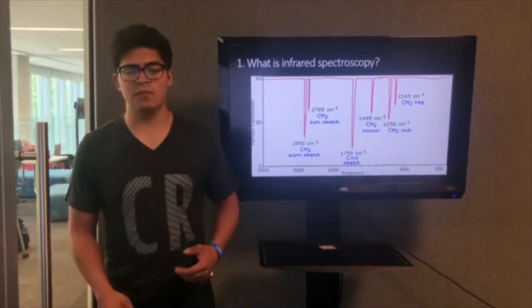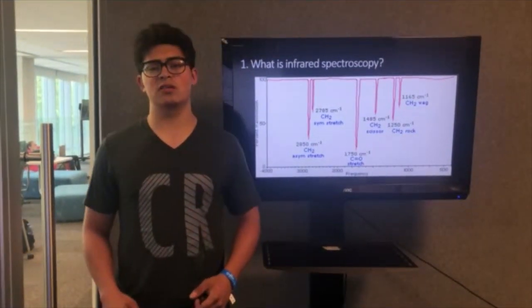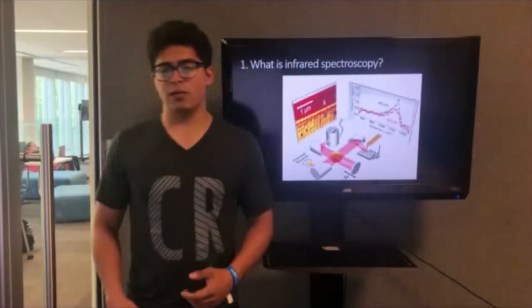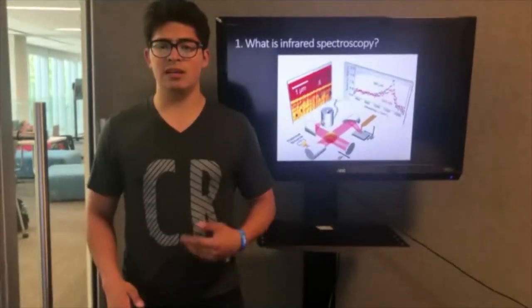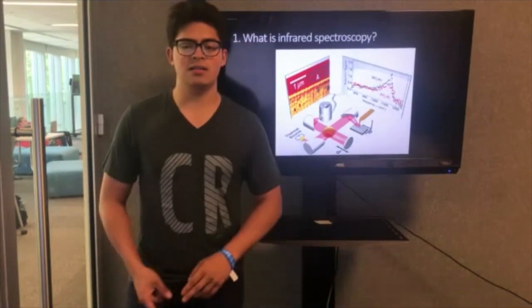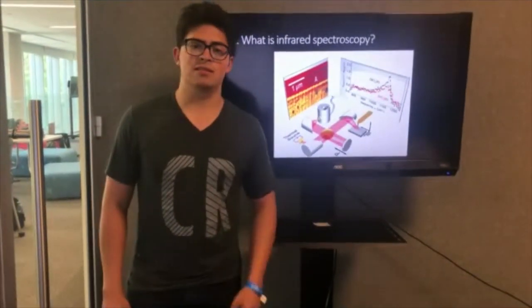The energy at which any peak in an absorption spectrum appears corresponds to the frequency of a vibration of a part of a sample molecule. One of the great advantages of this technique is that any sample in any state can be analyzed. It doesn't matter if it's a gas, a solid, or a powder, and any surface can be analyzed.